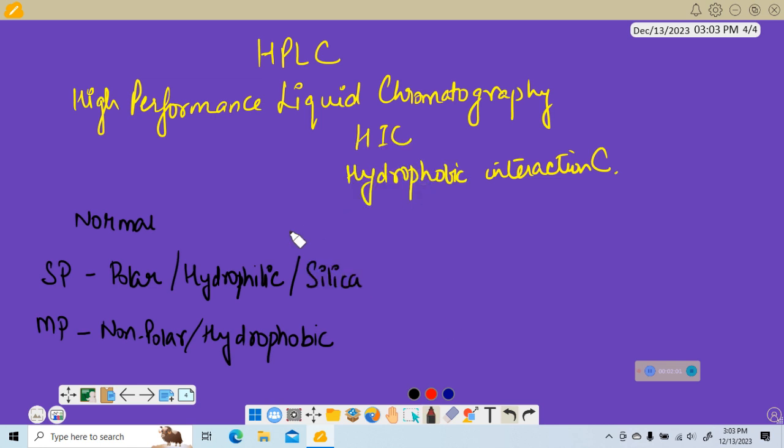Hydrophilic means they love water, like positive and negative attraction. Hydrophobic means they repel each other, like charges repel. If I talk about opposite, attraction, that is hydrophilic. Okay, so the non-polar, hydrophobic mobile phase here can be hexane or chloroform.